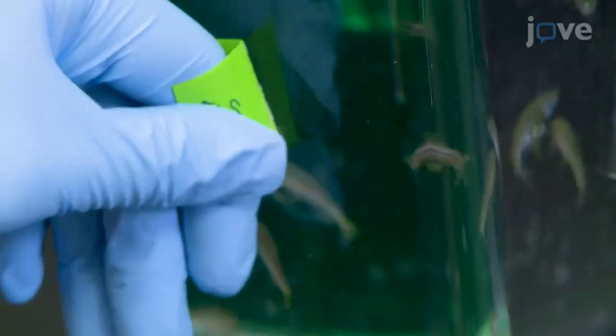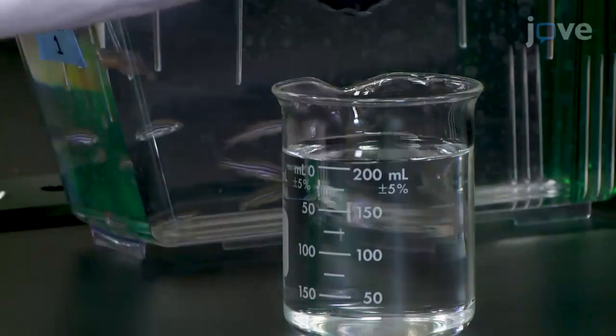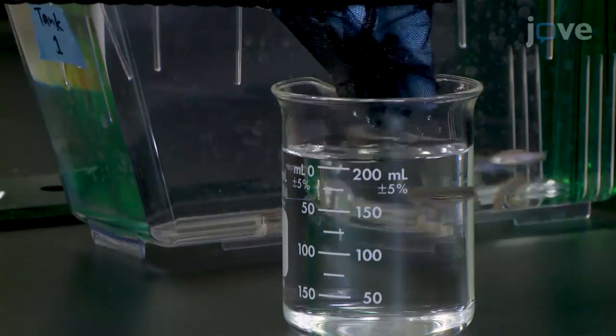Label the tank such that the condition or genotype of the animals is blind to the experimenter, and use a net to gently place a single adult into the pre-filled beaker.